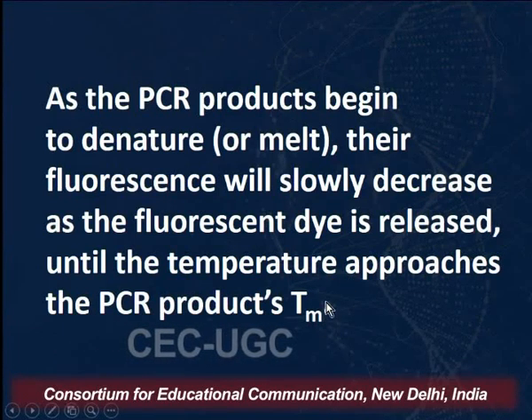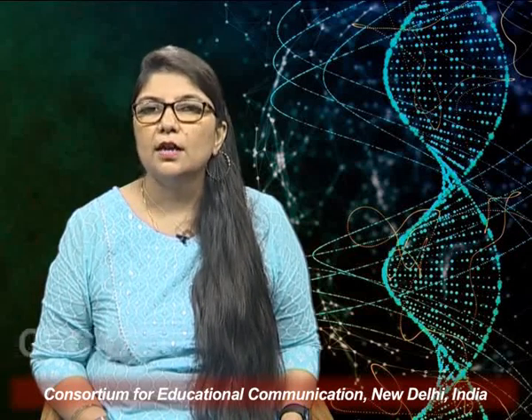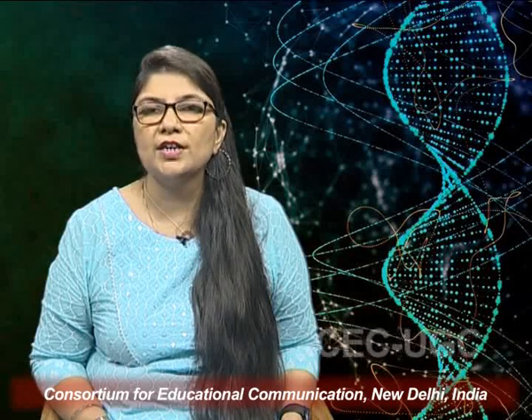So the melting temperature, for a typical double-stranded molecule, there is a specific Tm. There is a temperature point at which the double-stranded DNA starts separating. That is termed as the melting temperature.